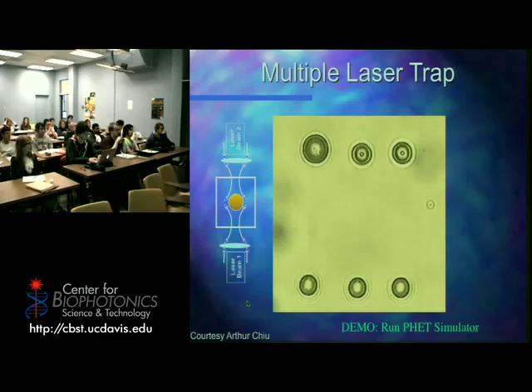Have you guys ever looked under the microscope at blood cells? Things are moving around. You ever looked at pond water? Little organisms are flying all over the place. It's hard to keep them still. Okay. Well, now you got the laser beam. The laser beam goes and grabs it. Boom. Now all of a sudden, I can grab that cell. It's harder to grab an organism. I can't quite grab an organism. They don't like it. It's a little too much energy focus. It's not very fun for them.